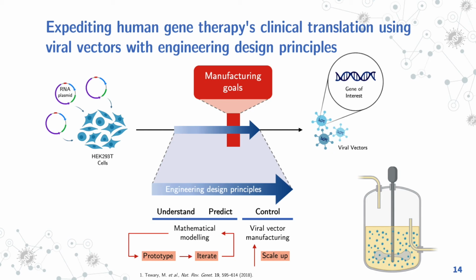In summary, canonical biochemical engineering principles must be applied to minimize the knowledge gap in viral vector manufacturing and expedite human gene therapy's clinical translation using viral vectors.